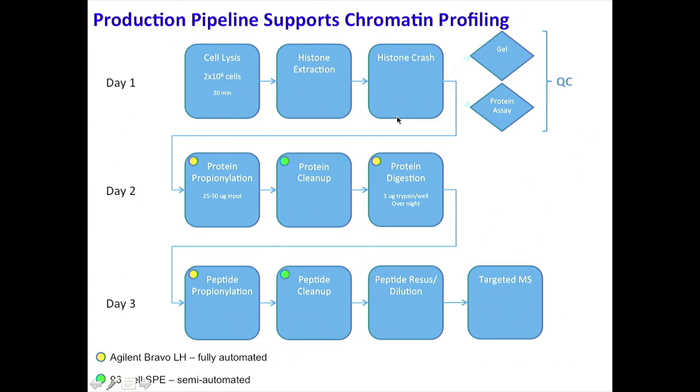And I also showed you this slide yesterday, but the thing that I want to point out today is that through our robust processing pipeline, we're doing all of these operations 96 samples at a time. So we do things at the level of a 96 well plate. The number of cells that we grow for each of these assays is more than you can fit in a 96 well plate, but when we pool everything all together, we try to do 96 at a time.